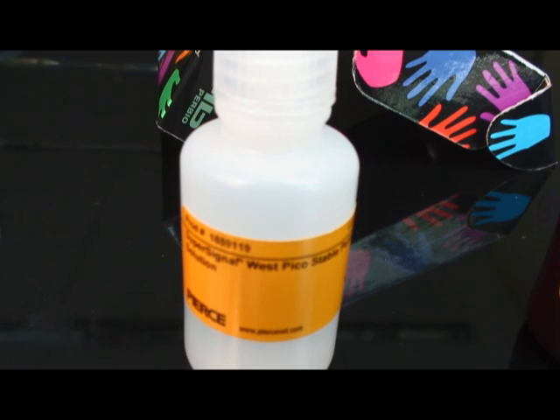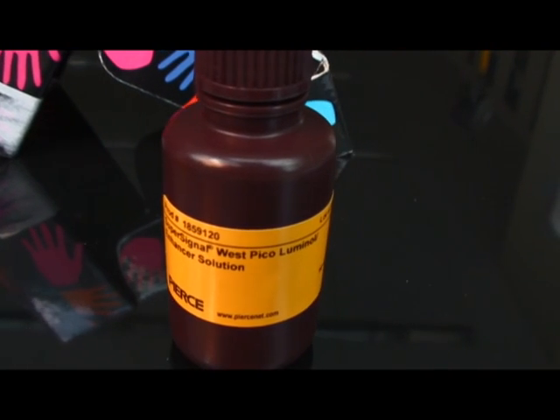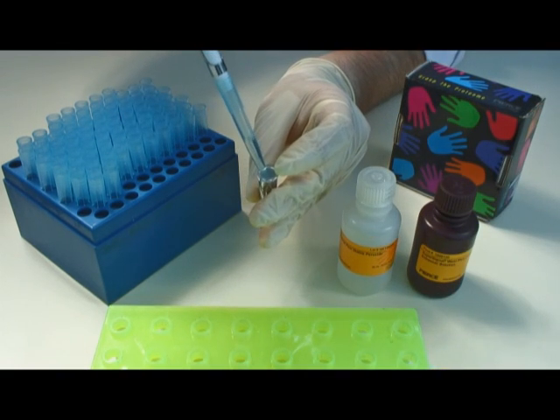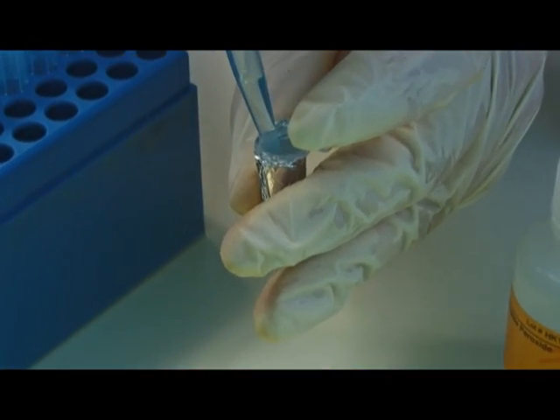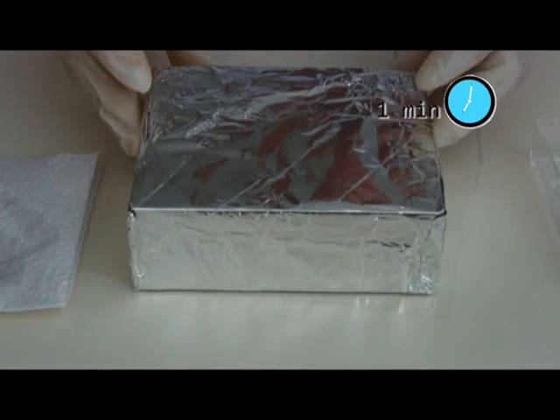To detect the reaction, you will use a chemiluminescent reagent. The product of this reaction generates light in the presence of hydrogen peroxide. For this purpose, add 1 ml of solution A to the light-protected tube with a clean tip. Use a new tip to add 1 ml of solution B. Mix both solutions. Take the membrane and add the mixture of solutions A and B on top of the whole membrane. For 1 minute, incubate it with the aluminum box that protects it from light.